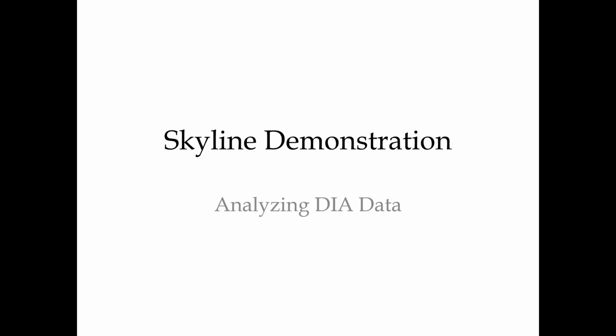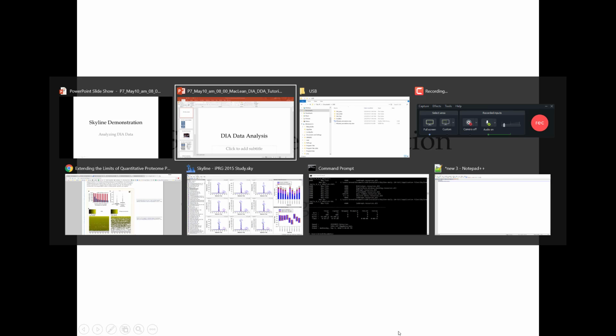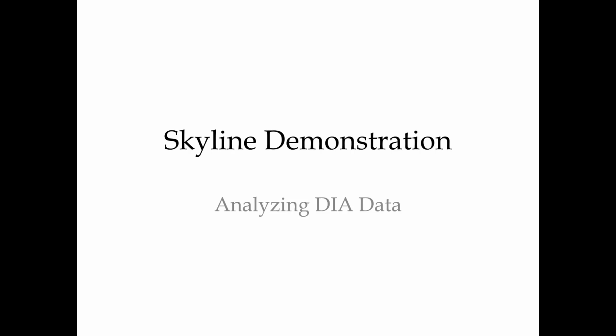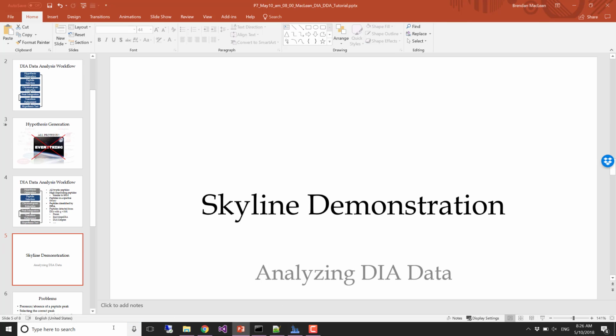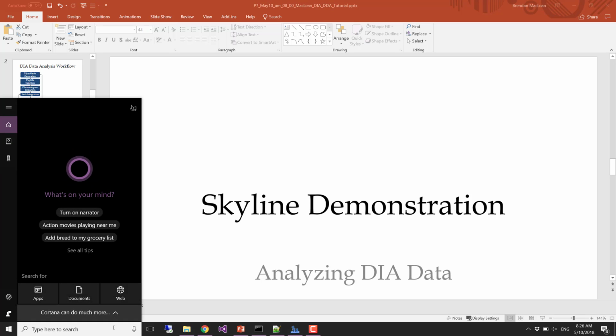The first thing I'm going to do is a quick demonstration of Skyline, and you can just watch this part, and then we'll get hands-on in a second. Skyline is really quite flexible, and this is, I guess, the most naive way to use it. So we'll do this like, I have no prior knowledge. Let me see if I can measure something in DIA, and I'll look over the whole gradient.